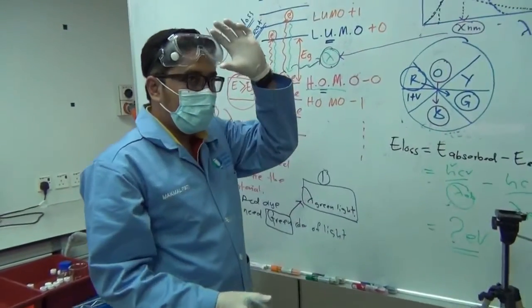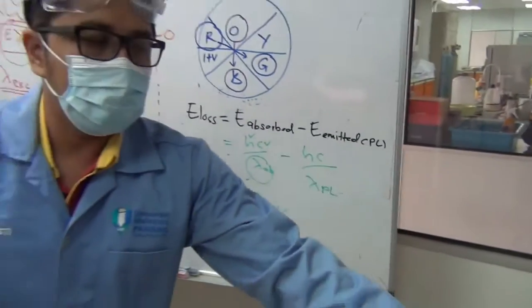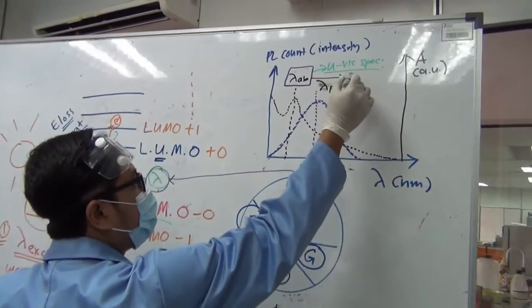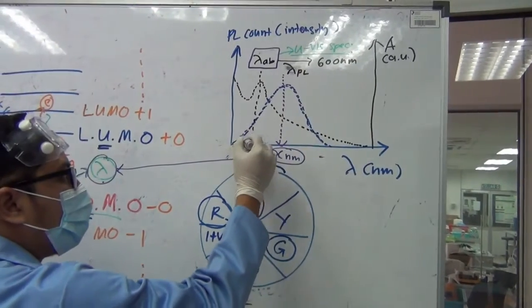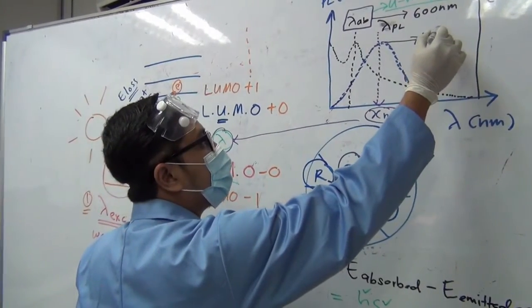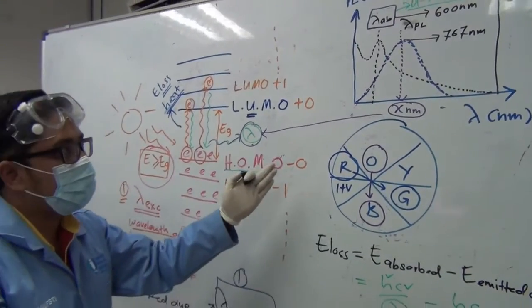You have predicted. Now you could take off your goggle. You're not playing around with the solvent for the time being. Now this you have set during the parameter setting around 600 nanometer. And from your PL graph, you see that this peak corresponds to 767 nanometer. Now you have achieved your second objective.